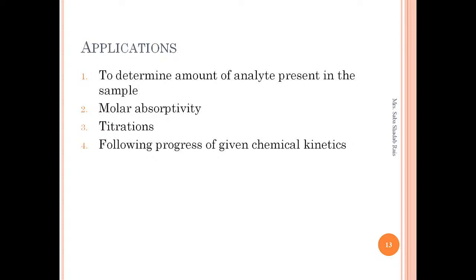Now where do we use this colorimeter? Applications are important; it can be asked for 5 marks. Just write down the applications of the colorimeter. And if principle, construction and application come together, it will be asked for 10 marks. So where do we use the colorimeter? To determine the amount of analyte present in the sample. This is usually what we do.